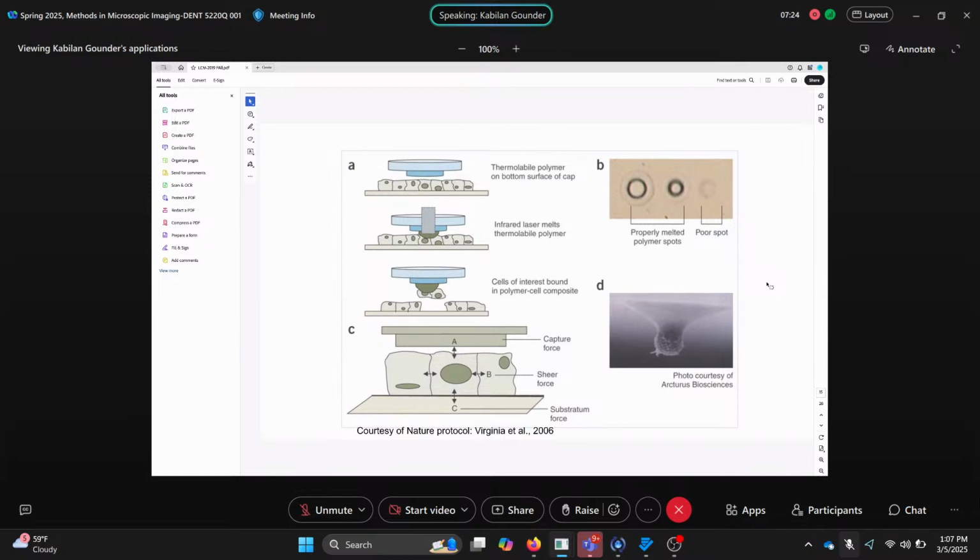If you isolate the cells based on structure, then you can use H&E staining, or if you want to isolate the cells which express a particular protein of your interest, then you can use fluorescence microscopy. So now you are going to isolate the cells. We discussed how we are going to isolate the cells.